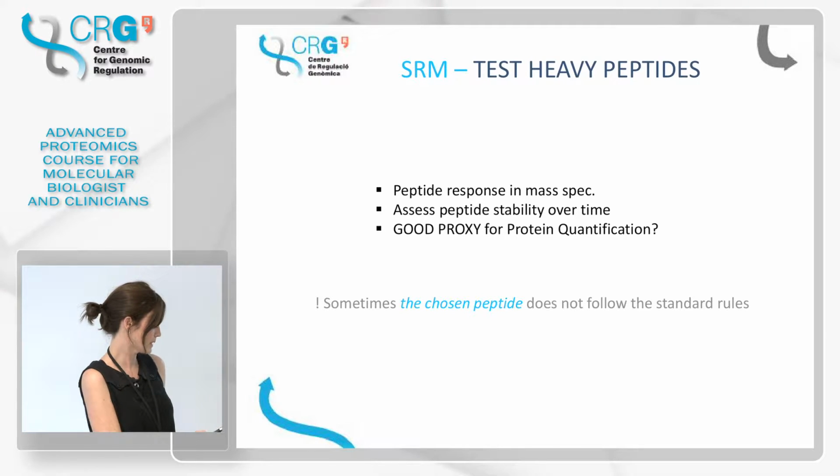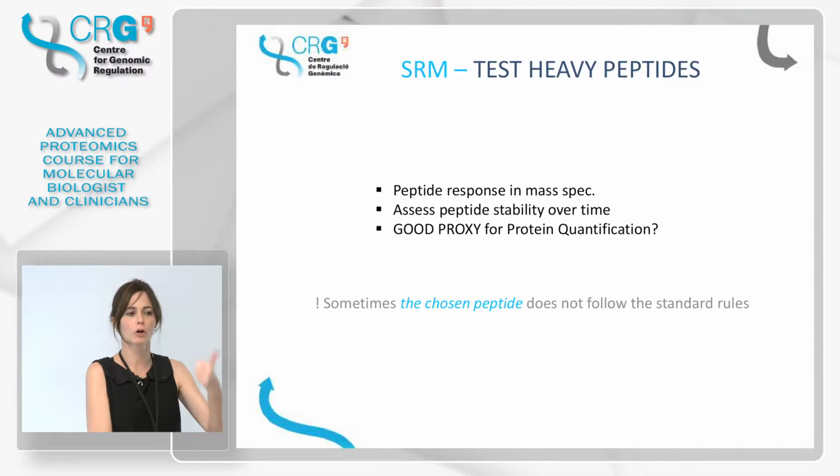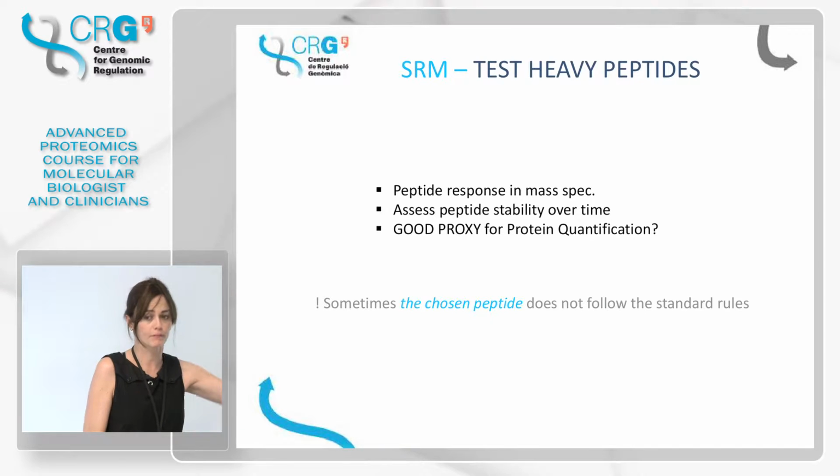So sometimes these chosen peptides don't follow those rules of no miscleavages, no methionines. Sometimes the best peptides are not following those rules, and sometimes one peptide that follows that rule, maybe it's not the best, because reality doesn't follow our logic sometimes.